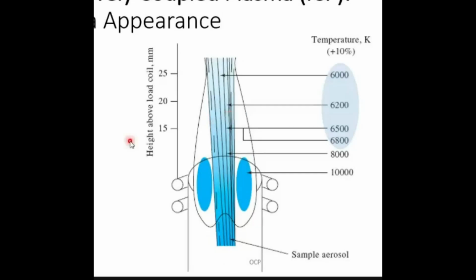These are the different temperature regions you can see. A region which is highlighted in blue color over here, that is these regions, not immediately in that vortex or the region where ionized argon and everything is getting heated at very high temperature, not that region.